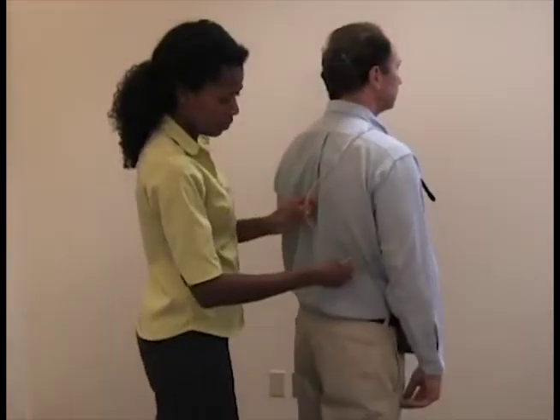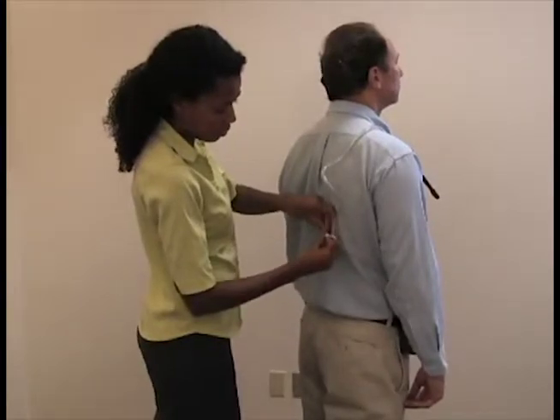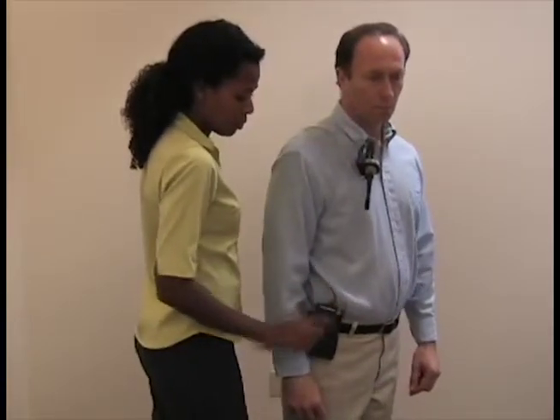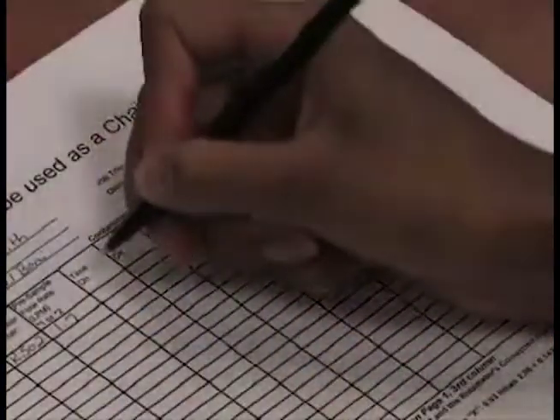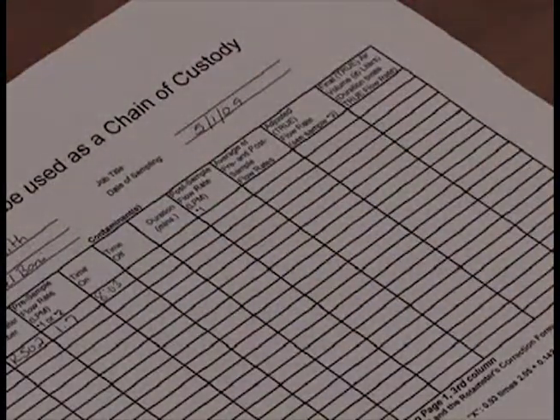Operate at a flow rate between 1 and 2 liters per minute for a total sample volume of 10 to 1,000 liters. Turn on the pump and record the time to the minute that you started the pump on the field data sheet. The counter records the minutes the pump is operating and should read zero when you start the test.